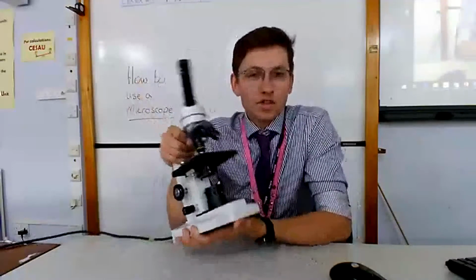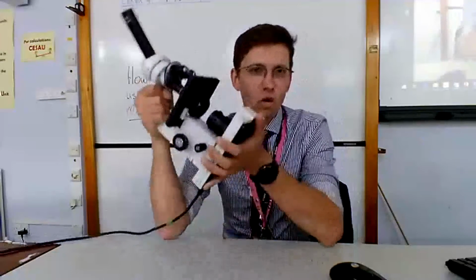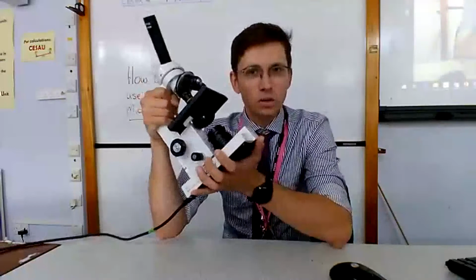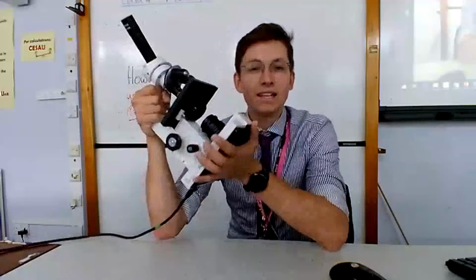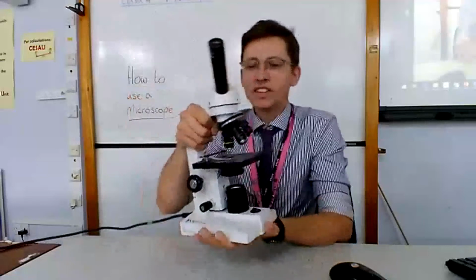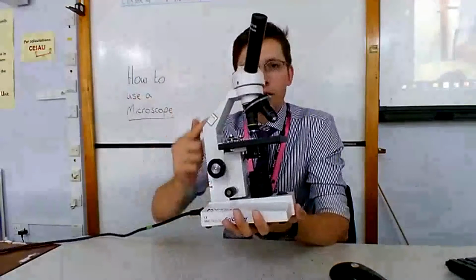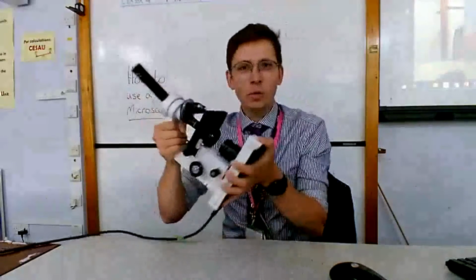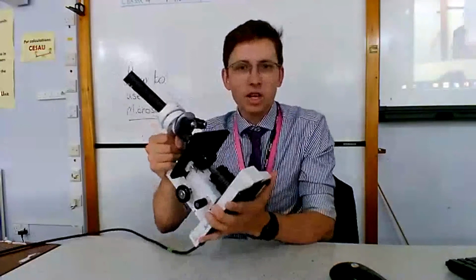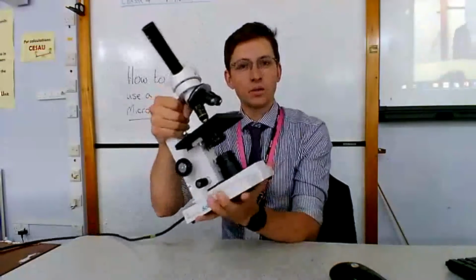You're going to have to collect it from a trolley normally, so we're going to have to hold it at 2 points on the microscope. So it's always a two-handed thing that we're going to do to walk with it. The first one is to have your hand underneath the base. Okay, so this part of the microscope here is called the base. And the second hand is always going to be wrapped around the arm. So this part of the microscope here is called the arm. Okay, so whenever anybody's walking with a microscope, any teacher will expect you to walk just like this. That's the safest way to walk.